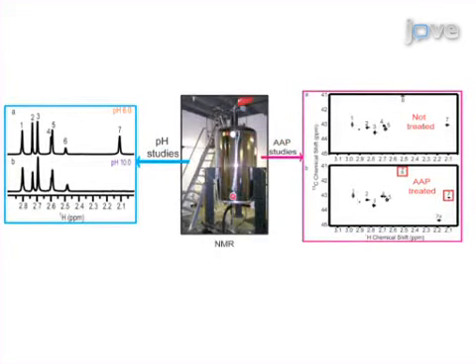Ultimately, NMR spectroscopy is used to show the absence of carbon-13 methyl resonance to make assignments. The main advantage of this technique over existing methods is that it allows for the unambiguous assignment of both the alpha and epsilon dimethylamine NMR resonances of the N-terminal lysine of a protein.